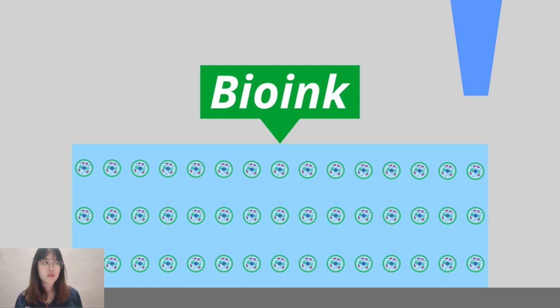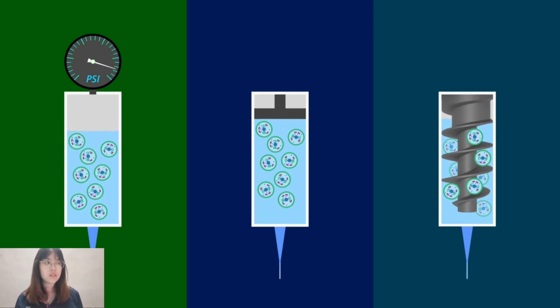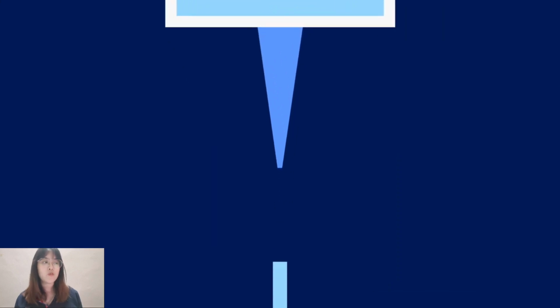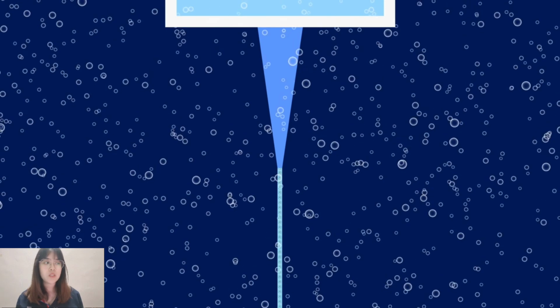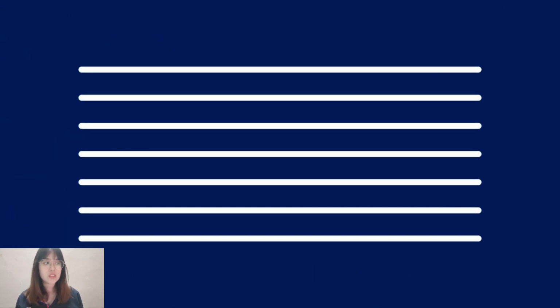The filaments are forced through a nozzle by either pneumatic pressure or mechanical force, which comes from things like pistons or screws, and must be stabilized quickly, or else it will not retain its shape. The bioink can be stabilized in a number of ways, largely depending on the hydrogel that is being used. As an example, during printing, the bioink can be stabilized by spraying a mist with a cross-linking agent dissolved in it. By the way, cross-linking just means linking one polymer chain to another, and this is done to stabilize bioink.